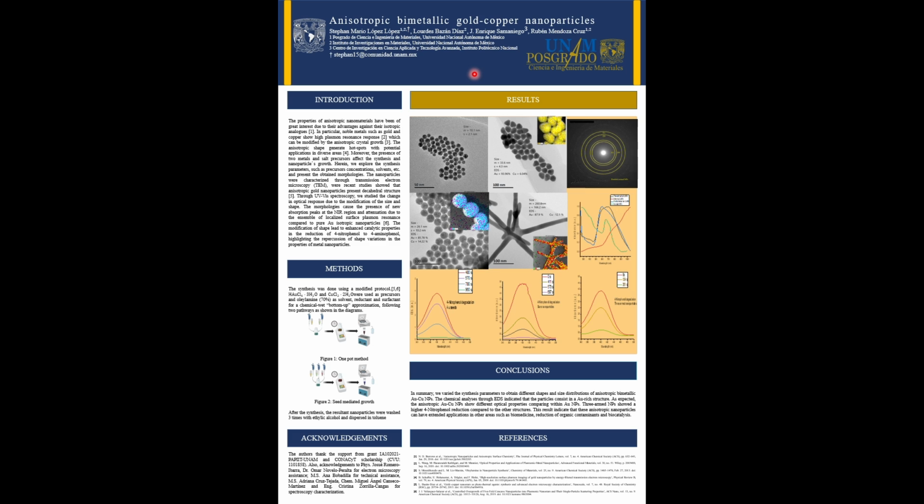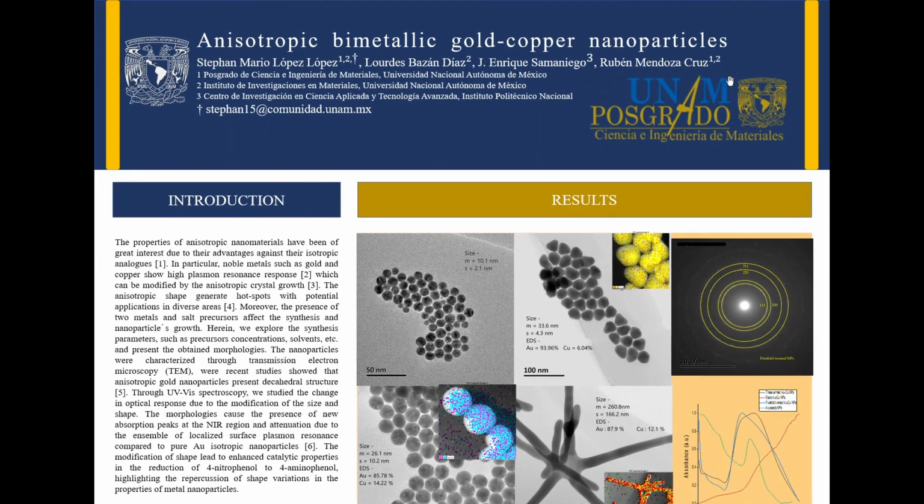This is a continuing master's degree project. We will talk about anisotropic bimetallic gold-copper nanoparticles. The authors are Lourdes Bazán Díaz, Enrique Samaniego, Rubén Mendoza Cruz, and your server Stefan Mario López-López. We decided to work on these innovative structures due to their physico-chemical properties.